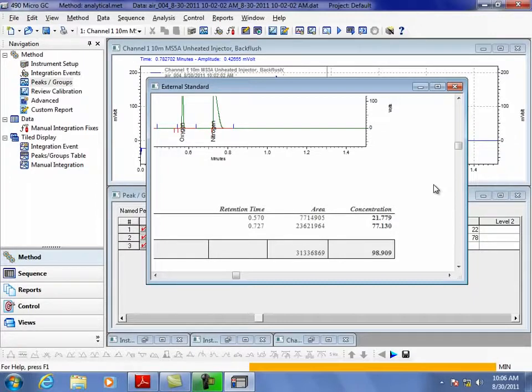The important thing is never get above 15 psi because you'll blow the injectors up. So your upper limit is 15. The other thing to remember about the injector on the Micro GC is that when it's not sampling, the sample is deadheaded against the injector. And when I say against the injector, in this case it's a silica chip with a little pressure point. So if you've got 42 pounds of pressure on your reactor, even if you're flowing 1 mil, doesn't make any difference.